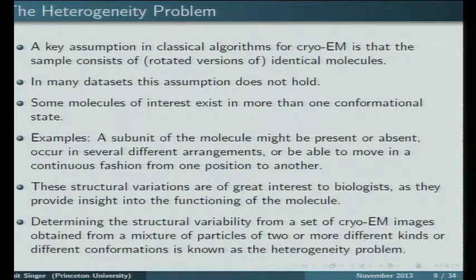Now I'm going to talk about the real challenge that we are facing, which is called the heterogeneity problem. And just like Joe asked me before, is it the same molecule? Is it the same structure? And usually the answer is no. We know that molecules change their structure with time. For example, protein channels have an open state or a closed state in which they let ions go through or don't. And there can be all sorts of variability in the 3D structure of the molecule.